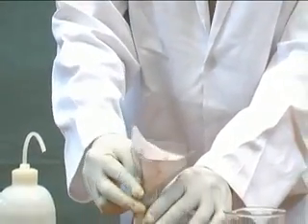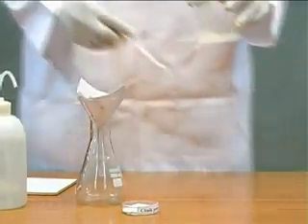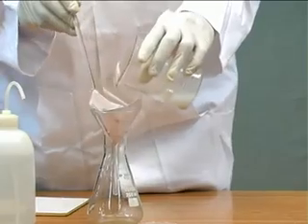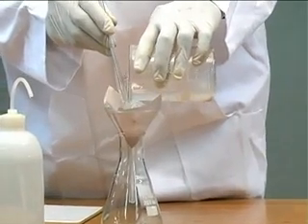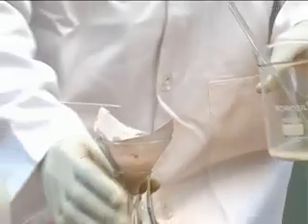The funnel is placed on top of a conical flask, and then the solution is poured with the help of a glass rod. This is done to prevent dripping of the solution through the sides of the beaker.